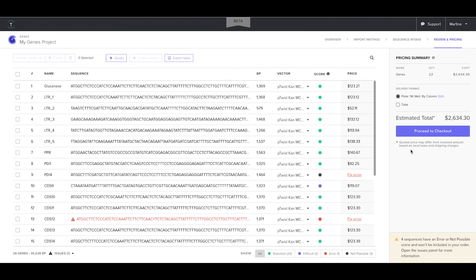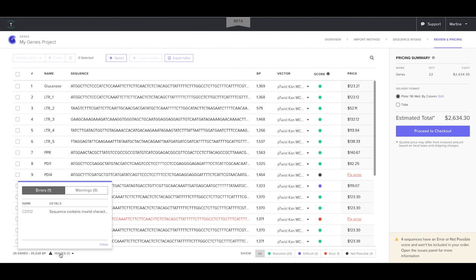Sequences which passed scoring will be priced in the pricing summary. Check that the number of sequences priced is the same as the number of sequences imported. Differences indicate issues which you must resolve to include them in the pricing summary. A summary of these issues can be found in the issues panel.